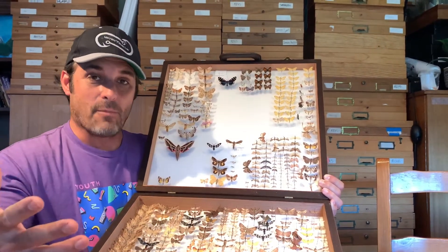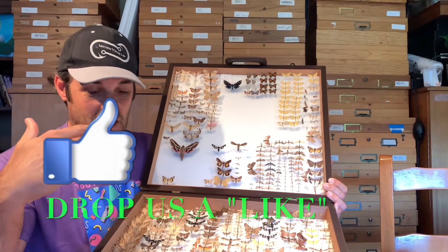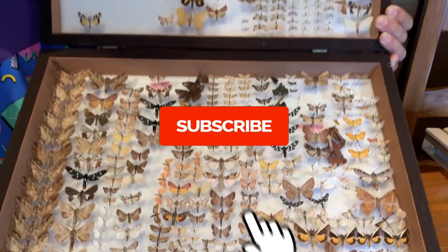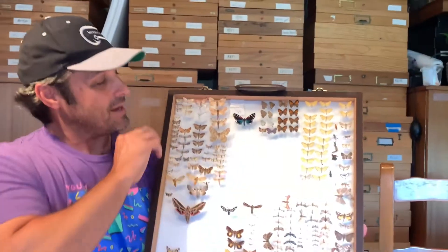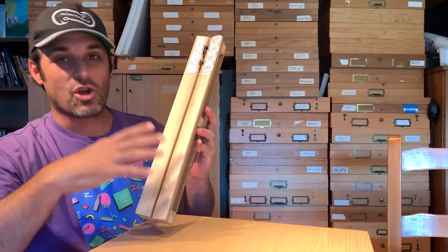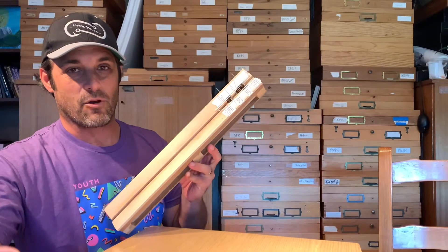It helps us understand our local fauna. Today's video is going to explain how you prepare a specimen for scientific mounting. We're going to use a board like this — a mounting board — and I'm going to show you how to mount a butterfly or moth specimen for scientific purposes.